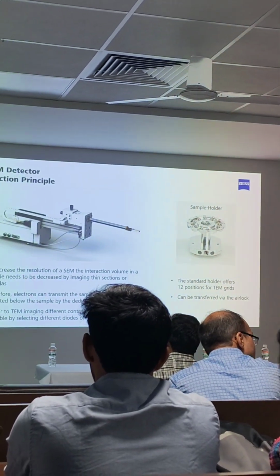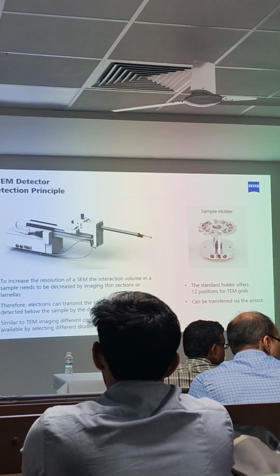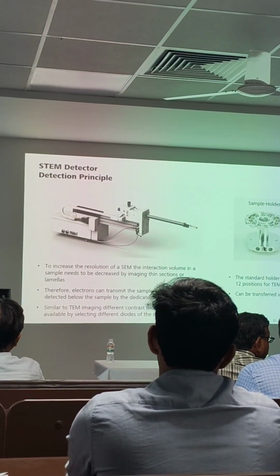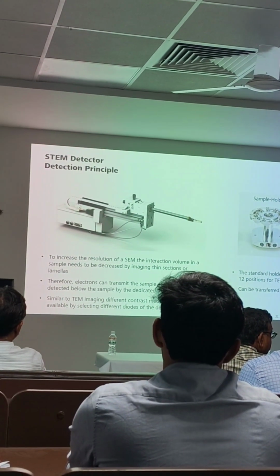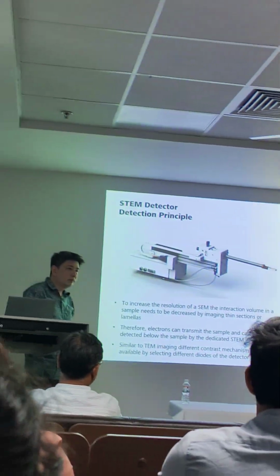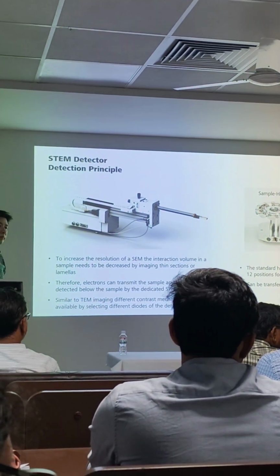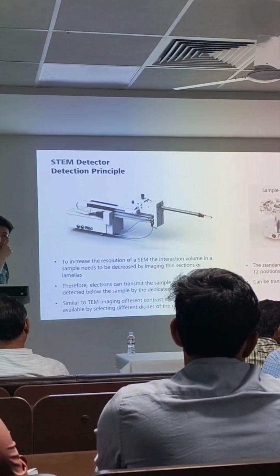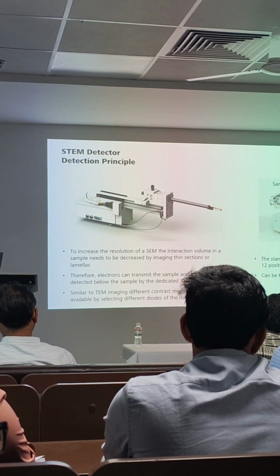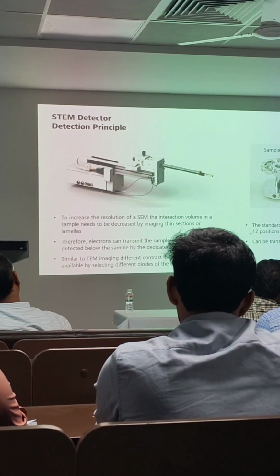So the sample preparation is also done on FIB. Yeah, the sample preparation for the TEM and the sample preparation for these detectors are identical. So the utilization of it: instead of going to the TEM directly, you can put your sample here and have a primary investigation of your sample. That is point number 1. Point number 2 is that for biological samples where 200 kV is too much, you can put your sample here and analyze under 30 kV accelerating voltage. So that is the use of it.